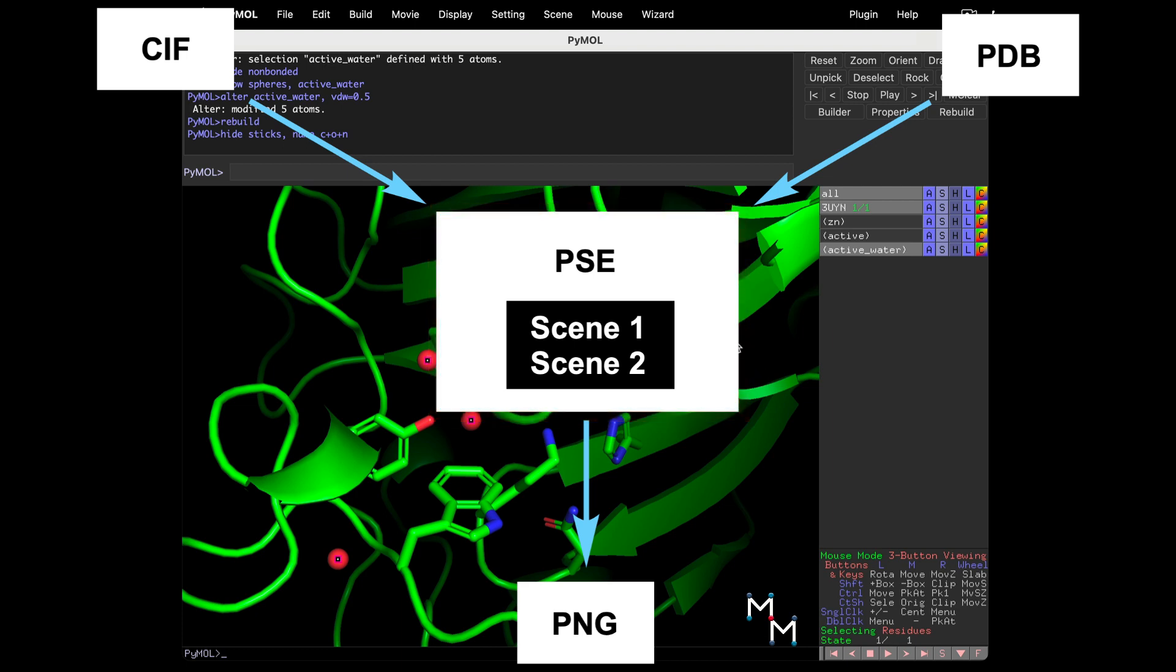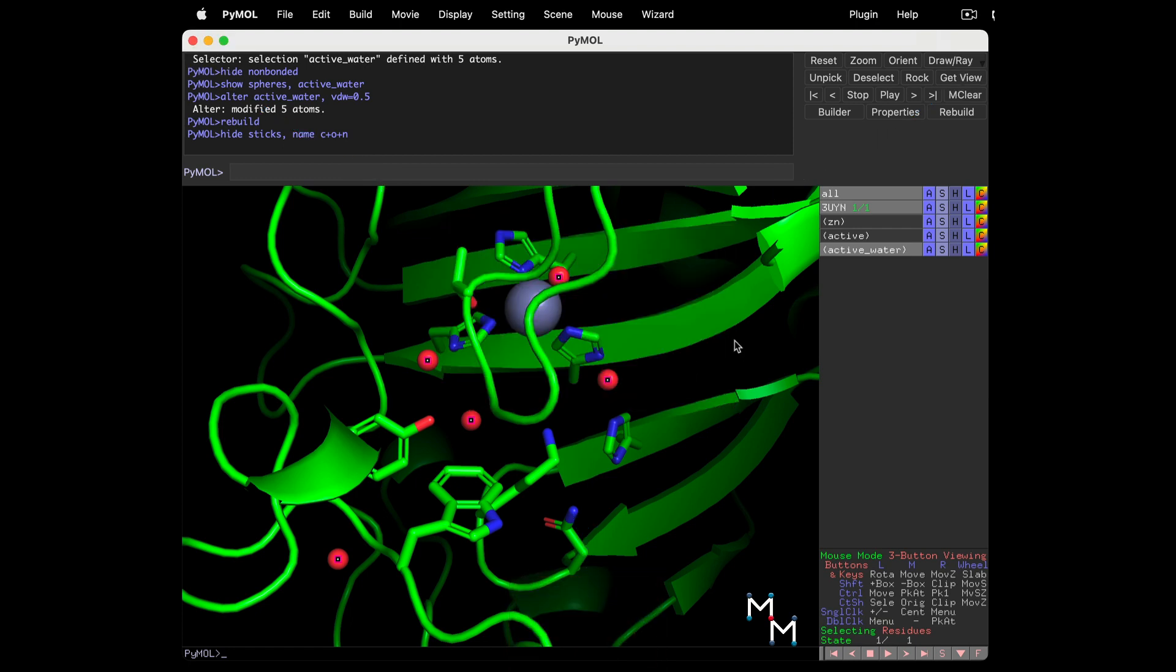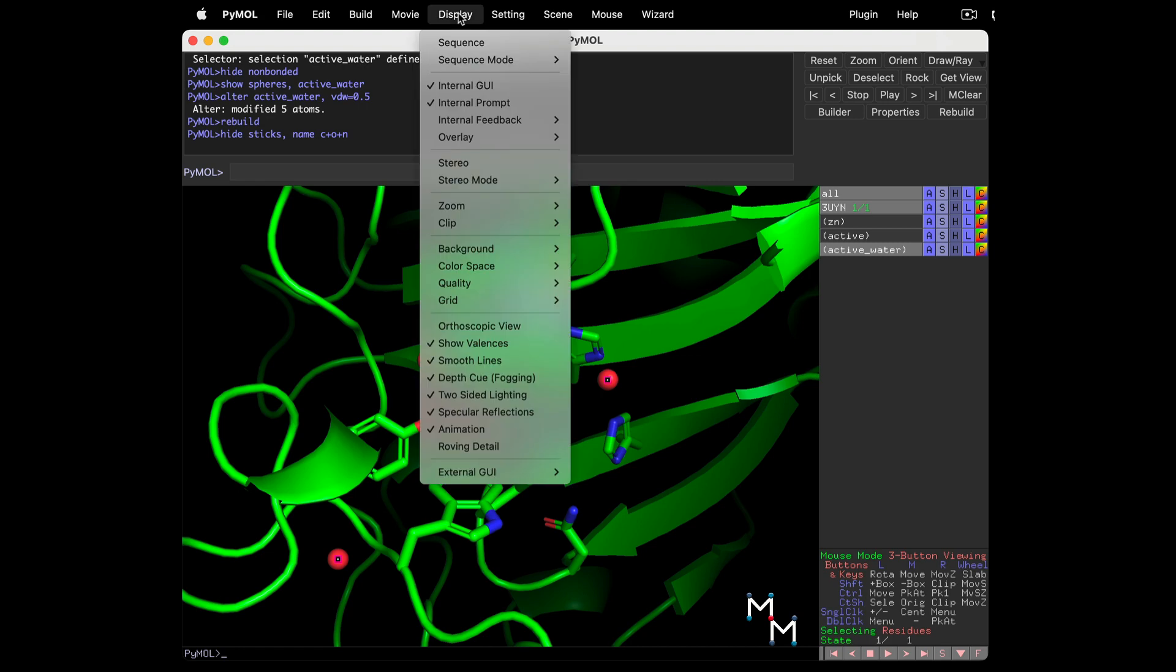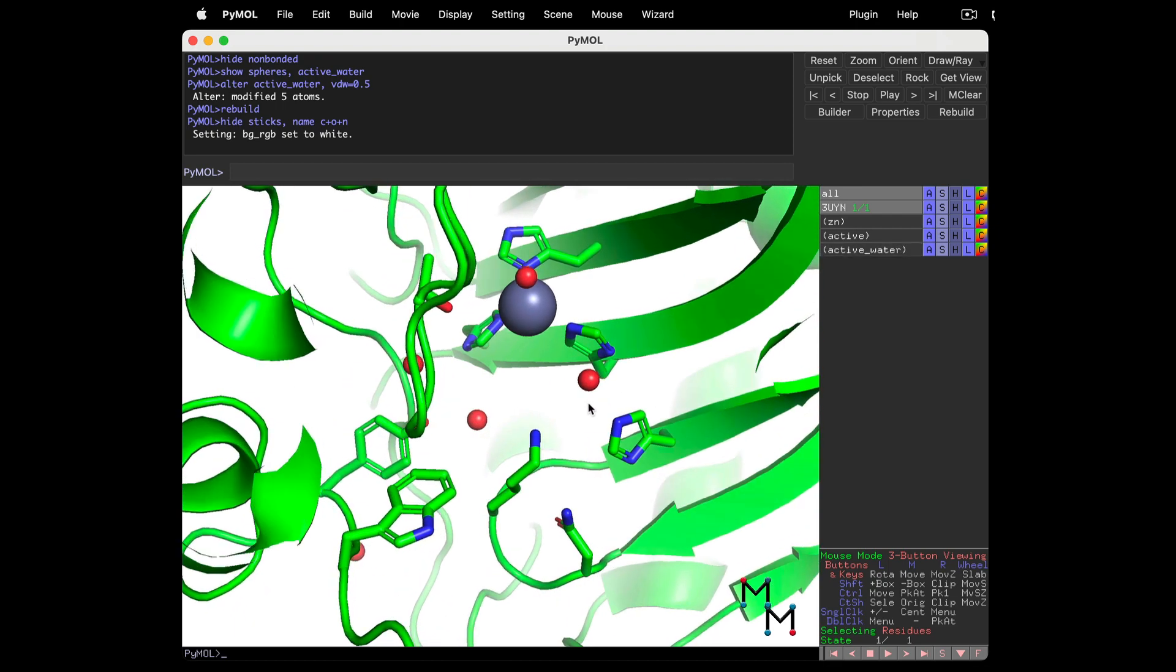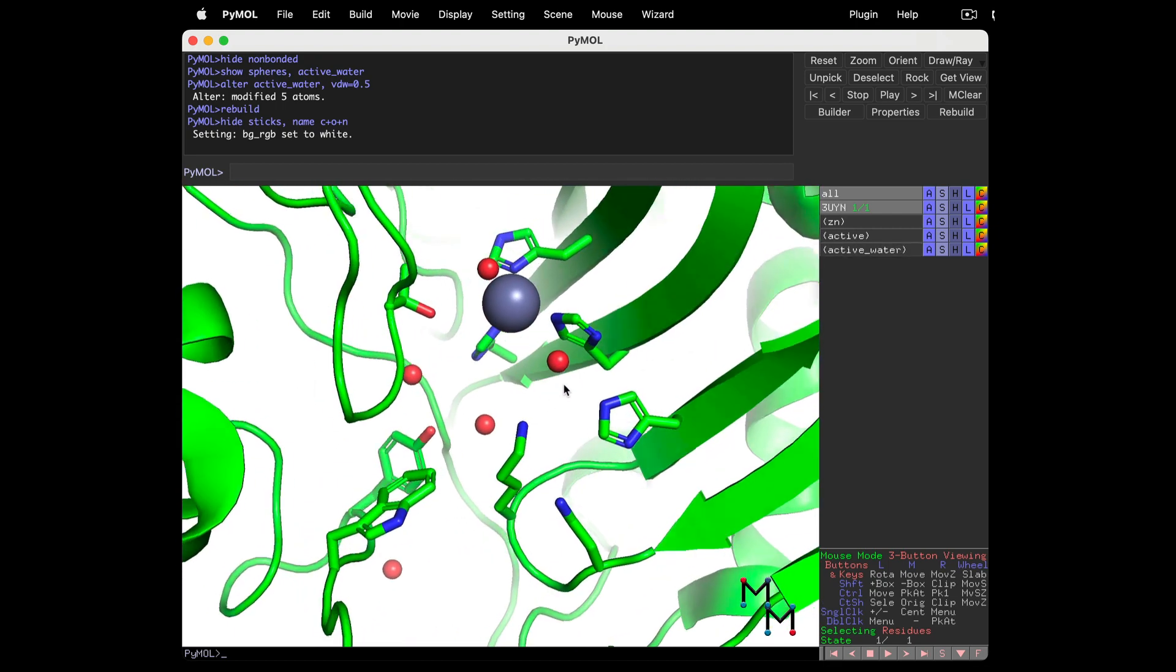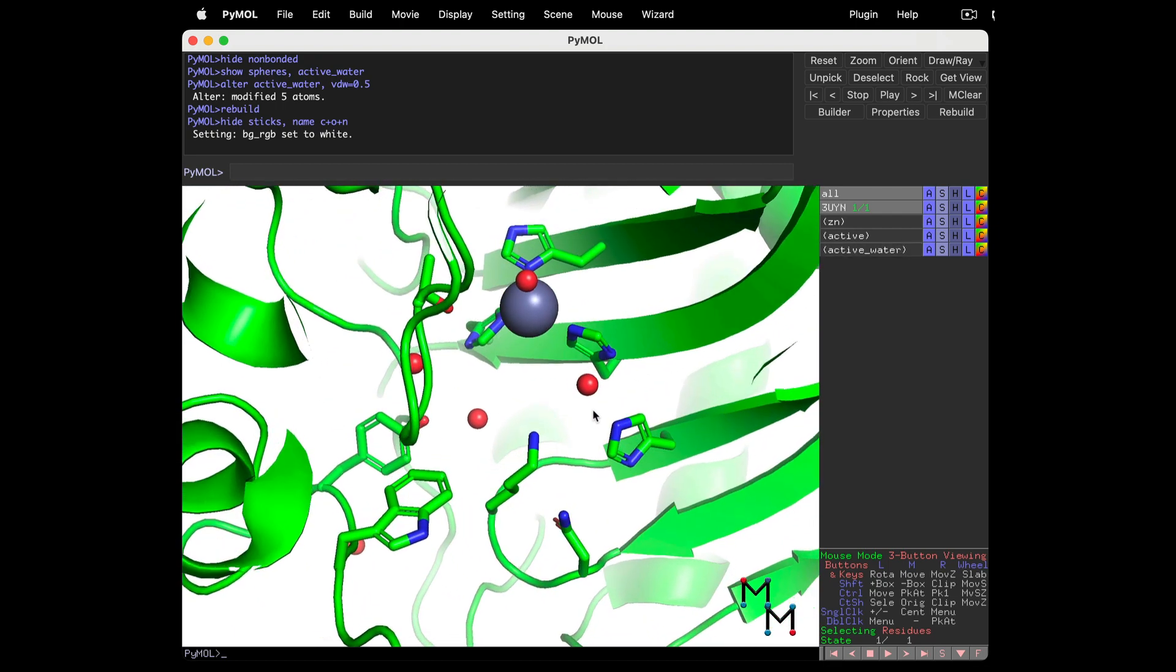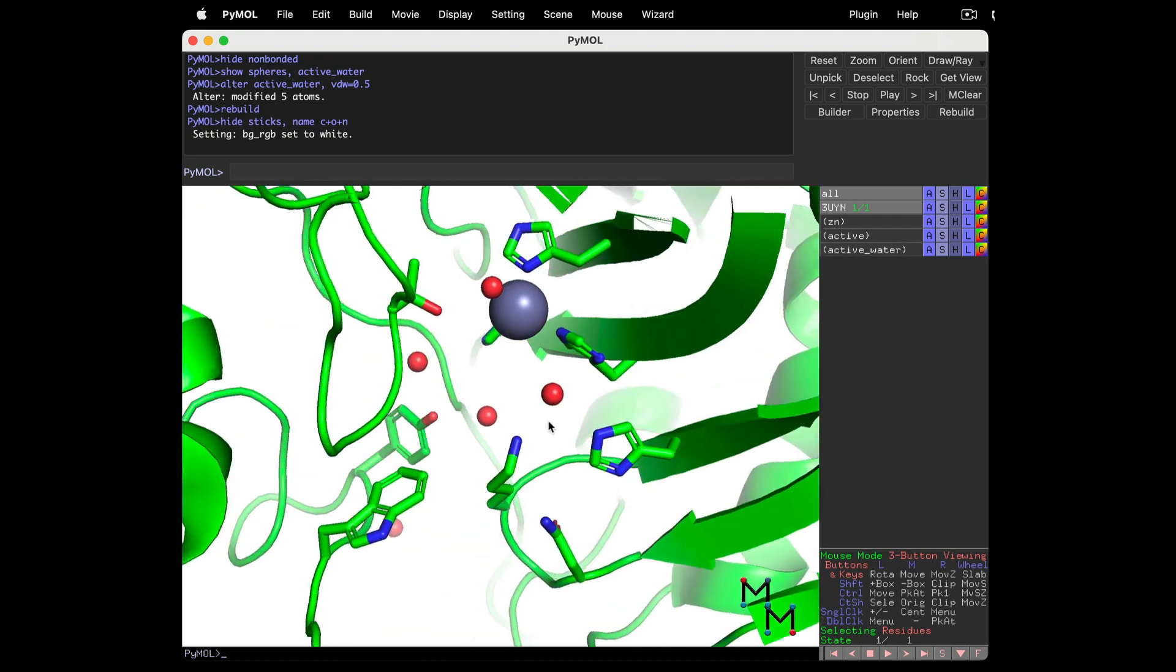Speaking of images, PyMOL exports PNG image files. To prep this structure for a publication quality image, we'll first change the background. In the drop-down menu, Display Background White. The color white is preferred because manuscripts have a white background, and the image appears to float against it.